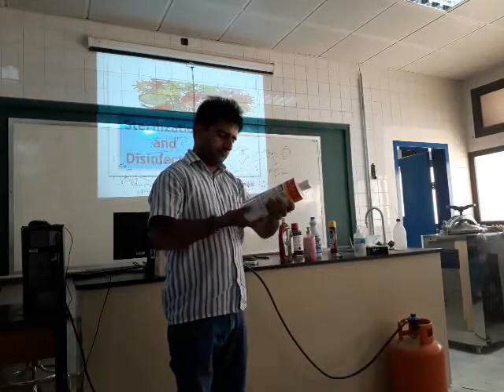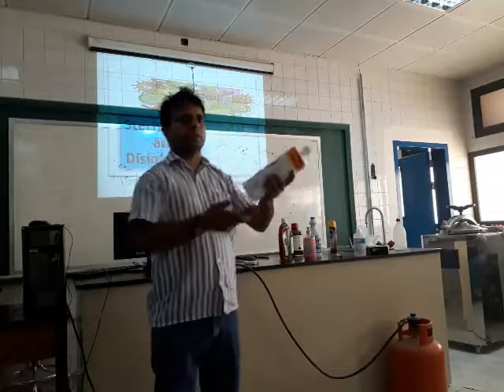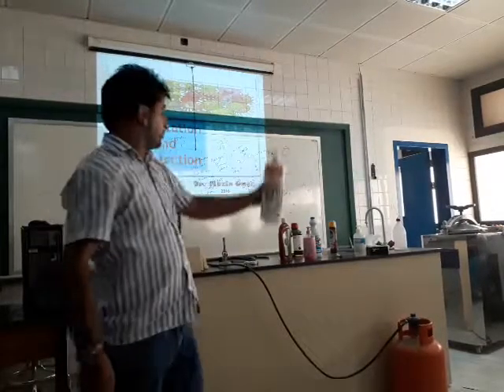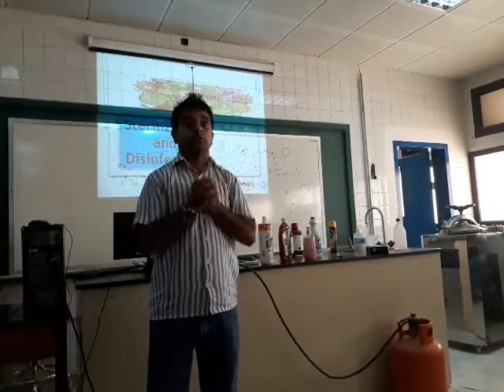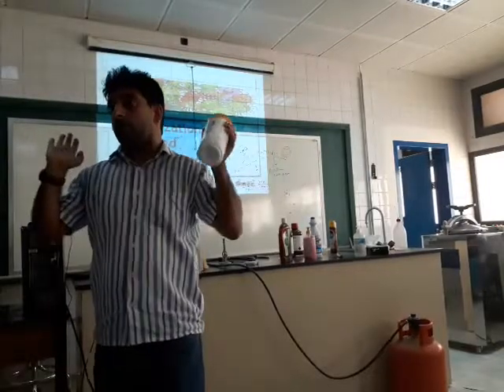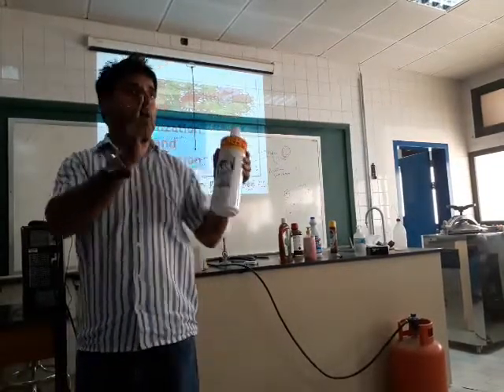Is there any indication of what? Yes, boys. Like this, it contains hydrogen chloride. It contains a combination of chlorine and hydrogen. And this is again a strong disinfectant. We cannot use this on our hand. It is a disinfectant, but we cannot use it.